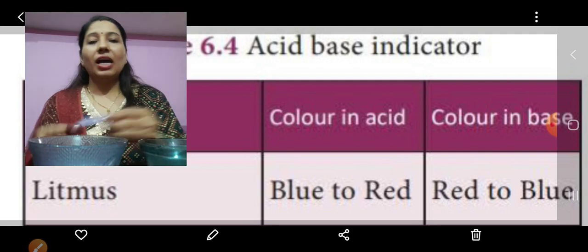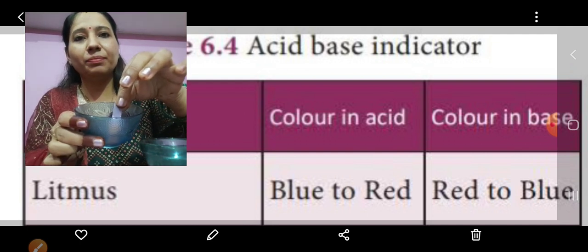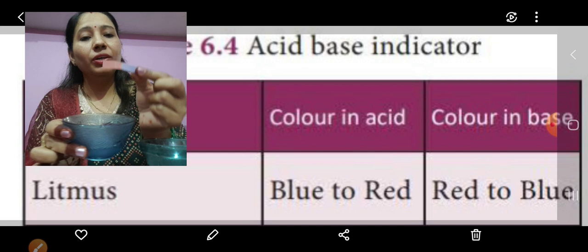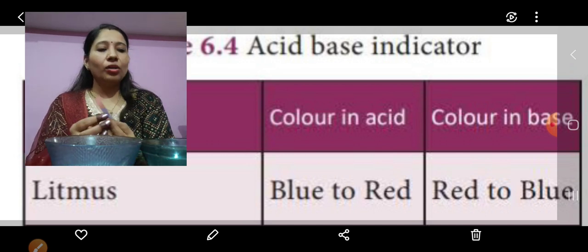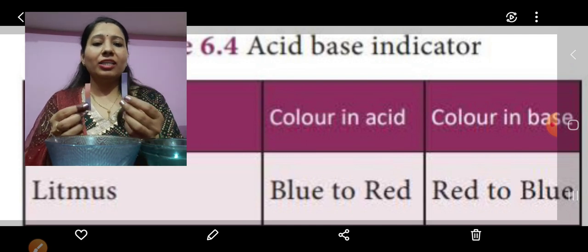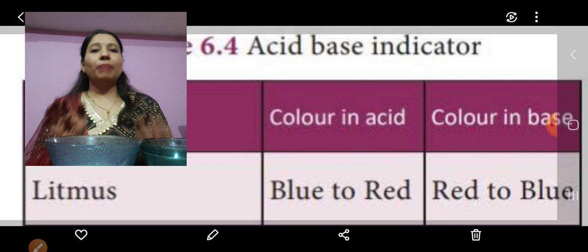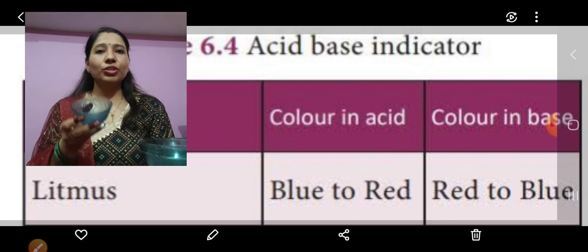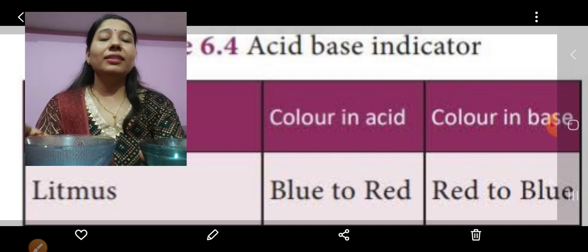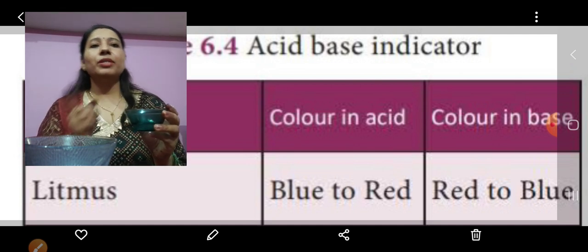Now I will take this blue litmus paper and dip it in the vinegar solution. See, the color is changing — the blue litmus paper has changed to red. That means, as you can see on the slide, blue litmus paper changes to red if it is an acid, and it remains blue if it is a base. So this vinegar solution is acidic because it changed the blue litmus to red, and the baking soda solution is basic because it changed the red litmus to blue.